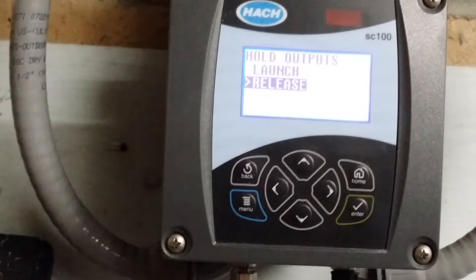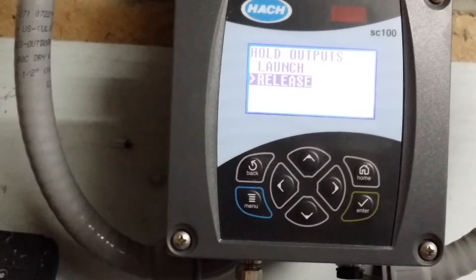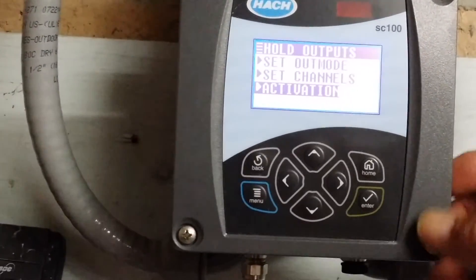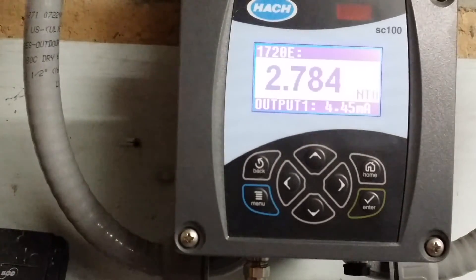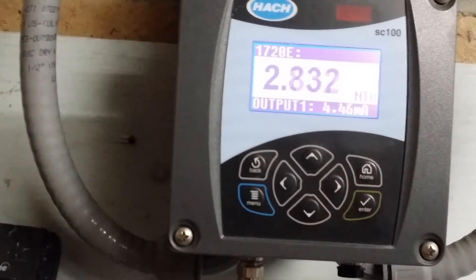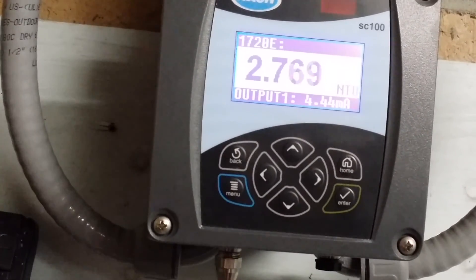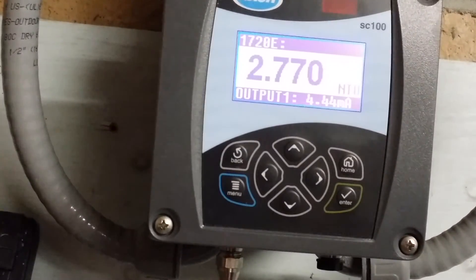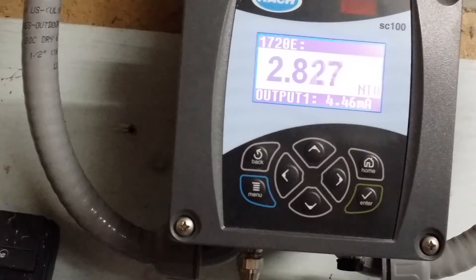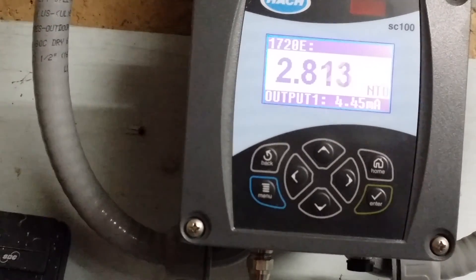At this point you will notice that the release bar is lit automatically. Hit enter — this automatically releases the hold outputs. Go to your home screen and to confirm this, you will see that your turbidity values are scrolling and are not flashing anymore. Please remember to always release your hold outputs so that we are not stuck in hold outputs mode and therefore not providing a correct value for your turbidity readings. Have a great day and thanks for tuning in.